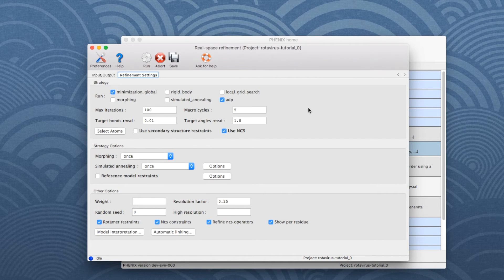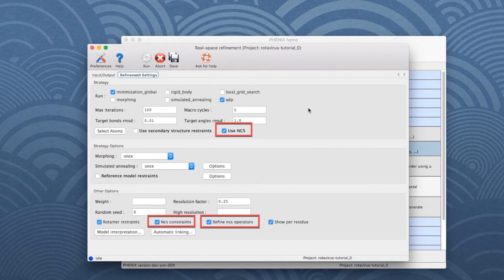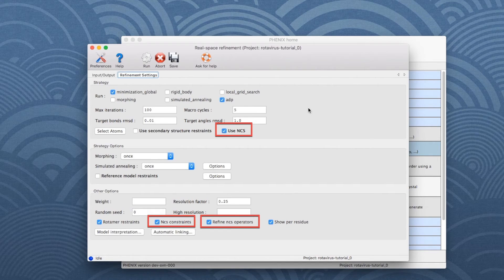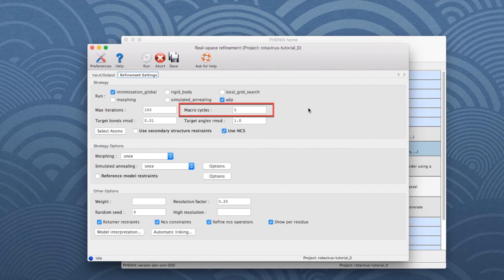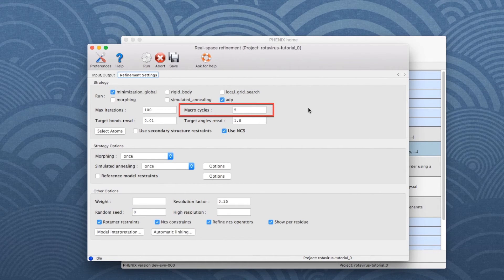the tool will automatically search for NCS and if present, it will attempt to determine NCS groups automatically and use them to define NCS constraints. The number of refinement cycles is set to 5, but it can be changed in this box.